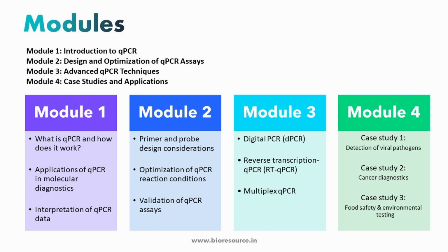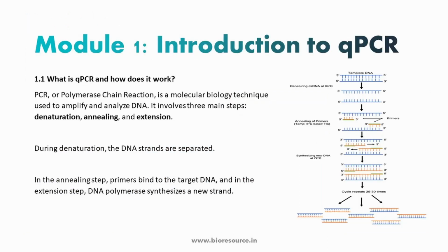Today I will be covering module 1, which involves the basics of qPCR and the applications of qPCR, and an overview of what PCR is and what the applications are and how we can interpret the qPCR data. And in coming modules, we will delve deep into primer and probe design considerations, assay optimization conditions, and various advanced qPCR techniques. And in module 4, we will take some of the assays and see how to design the primers and probes, and how we can optimize these parameters. So these are the 4 modules which we will be covering in this course. So let's jump directly to the basics of qPCR.